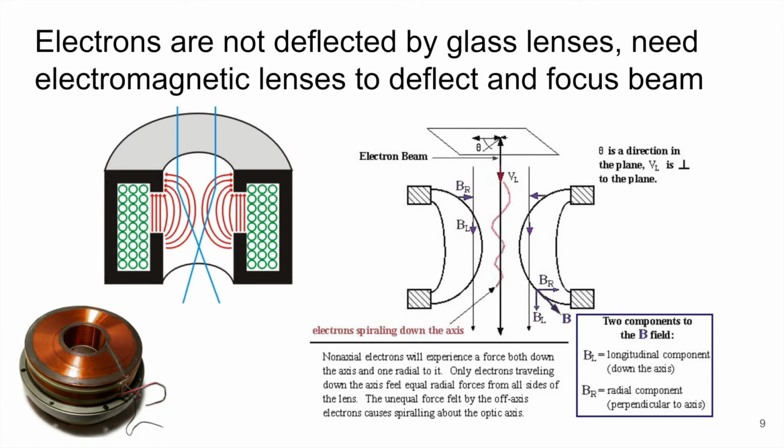But first, before we get to that, we've produced this electron beam with the electron gun, and we're accelerating it at the specimen. And so the purpose of these lenses, as it was with light microscopy, is to focus that beam now into a small diameter so that we can form the image. And that's what these electromagnetic lenses do. And they focus these electrons by deflecting them. That's how we have to have those.